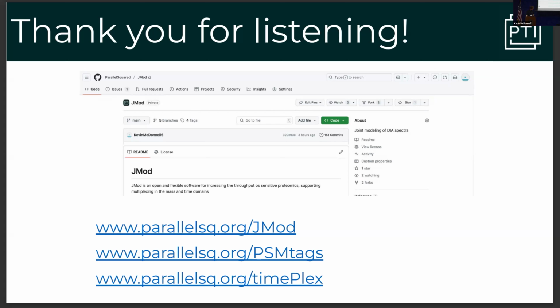But we certainly envision possibilities of having multiple separations on a single column using isocratic separation, other approaches that we've discussed with you and Jared and other colleagues. I think there's a lot of space for innovation to make this a really robust product. At the moment, I would not recommend everybody go run TimePlex. I think that's a good thing for experts to do and get their hands on, and innovators in the technology to push it forward. But we foresee that the ultimate implementation of TimePlex is going to be different from the specific proof of principle demonstration that we've done.